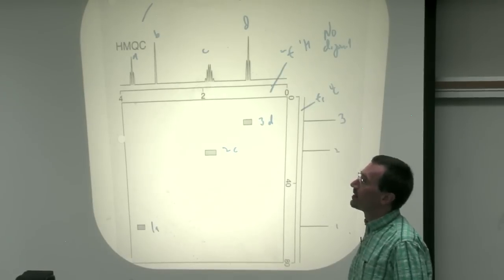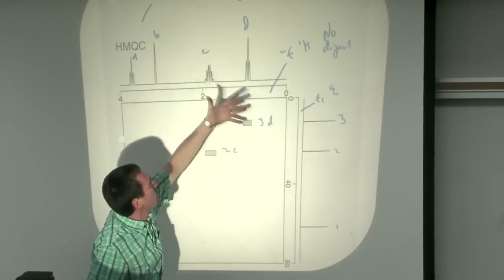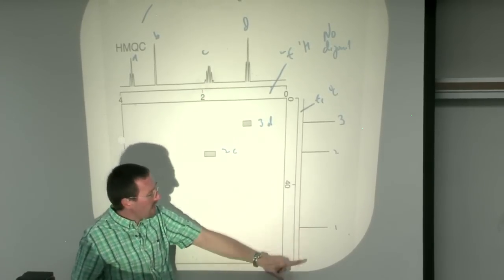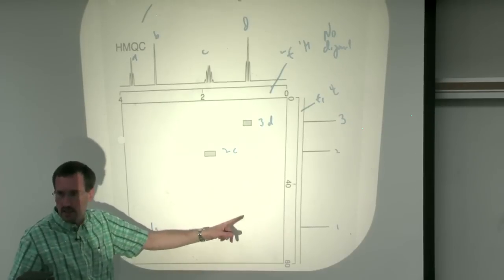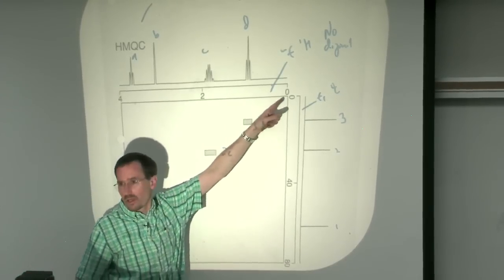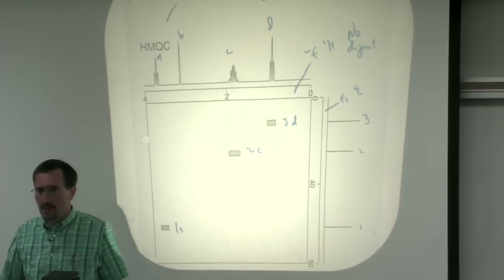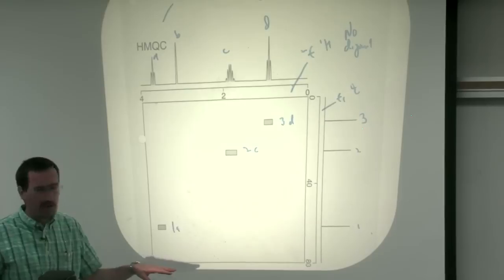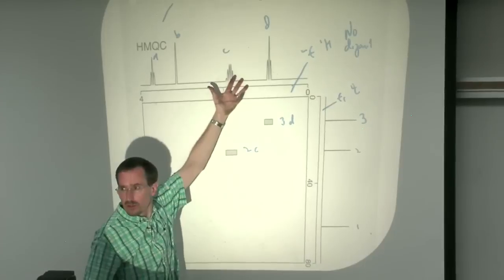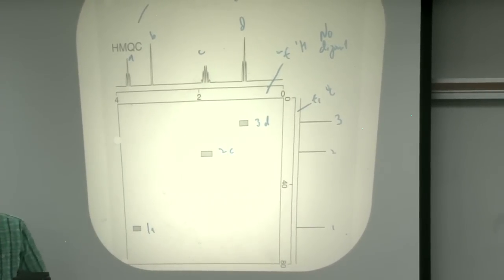And in fact, well, let's see, which way is it typically plotted? I think it's typically plotted this way because you could envision picking this up and putting it here. So I think you will always see downfield down here, but I could be wrong. It's of no consequence. Let me put it this way. It's of no consequence whether we go from 0 ppm to high ppm or high ppm to 0 ppm. You will also see, maybe in the textbook, a few HETCOR spectra given for some of the compounds. In a HETCOR spectrum, the C13 is going to be up here and the proton will be down here. Other thoughts or questions?